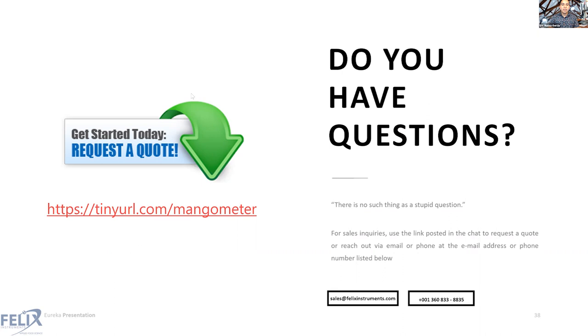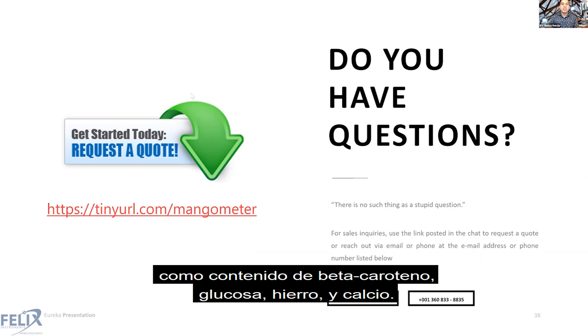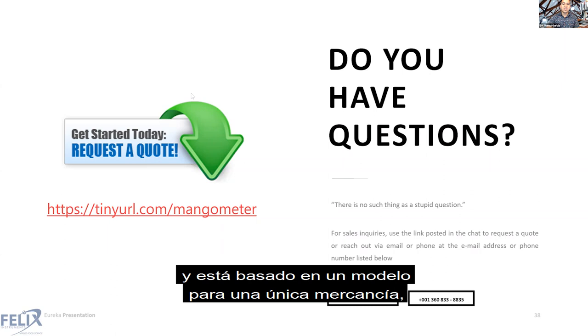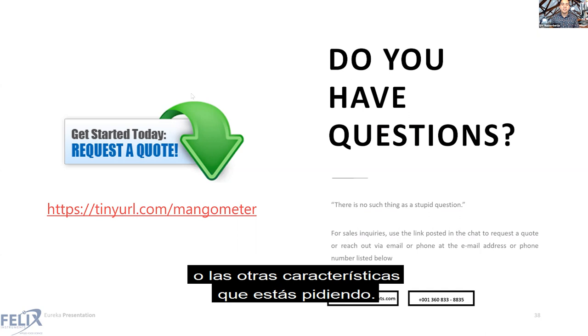Question 3 by Ruben. NIRs have been calibrated to measure other traits like beta carotene, glucose, iron, and calcium content. Is it possible with this meter? Again, the F751 comes pre-calibrated and it is based on a model for a single commodity. So in this case, the 751 mango meter is not calibrated, or there's not a model for beta carotene or the other traits that you're requesting.